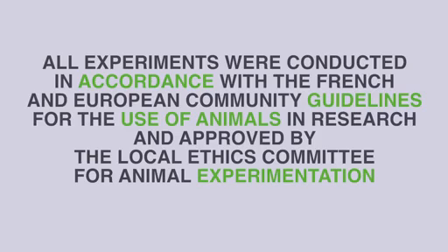Therefore, zebrafish represents a good model for investigating brain remodeling following a stress under acute and hyperglycemic conditions. It also allows investigating the biodistribution of radiolabeled molecules and potential therapeutic agents. All experiments were conducted in accordance with the French and European Community guidelines for the use of animals in research and approved by the local ethics committee for animal experimentation.